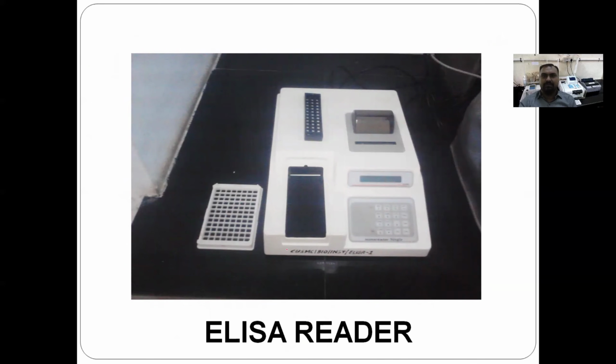So here you can see this is a type of ELISA reader. This is a microtiter plate. It contains the wells. This is a ready-made kit available. In the first row, we add the calibrator, the concentration is known, and then we add the unknown serum. Based on the graph, we get the result. So here we put the microtiter plate.